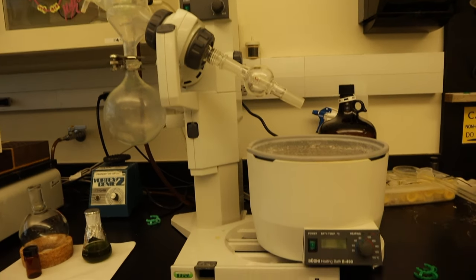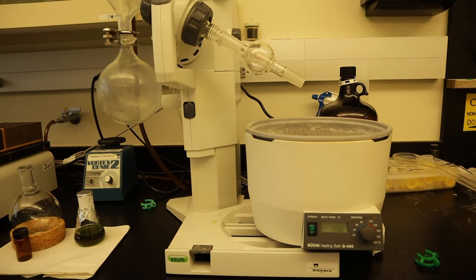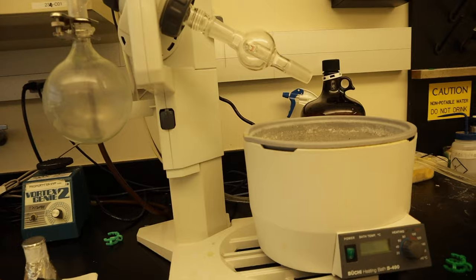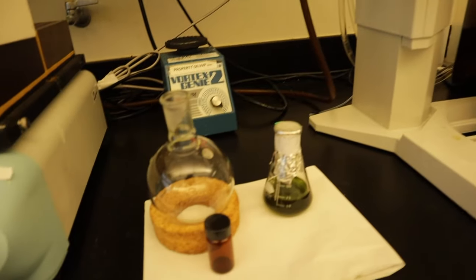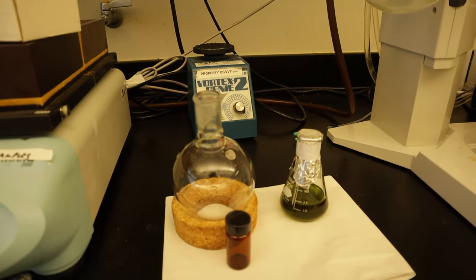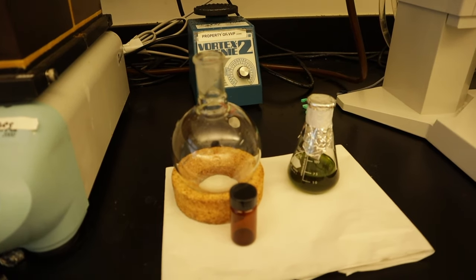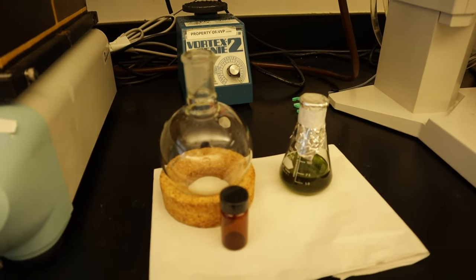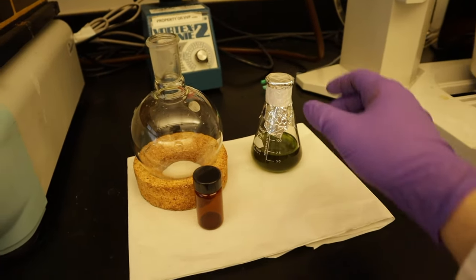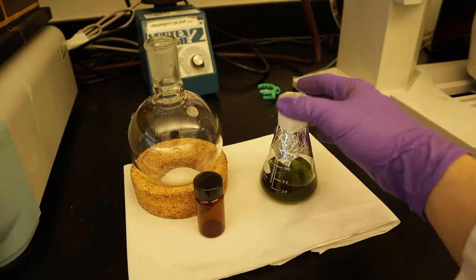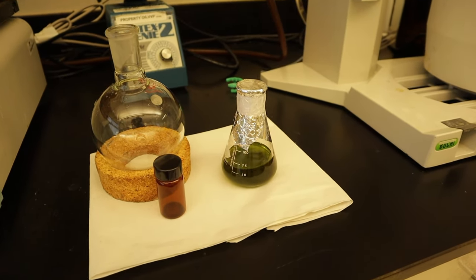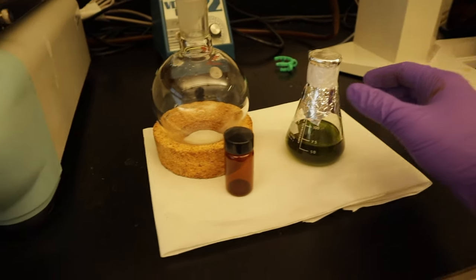Hello guys. This is a rotary evaporator and we will be using this today for our plant extraction. How do you set up the rotary evaporator and how do you load your samples? All you need are these items. First is your plant extract macerated in a solvent.